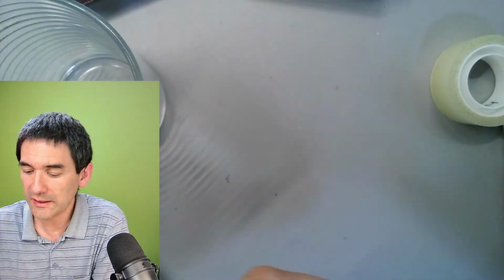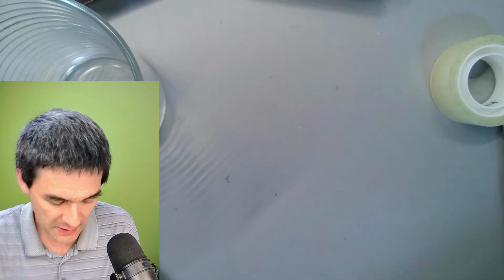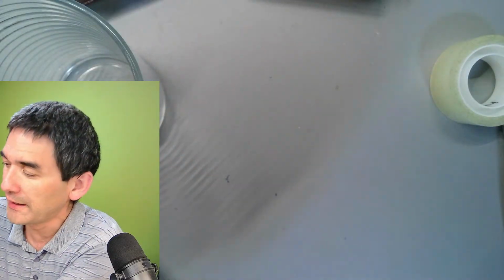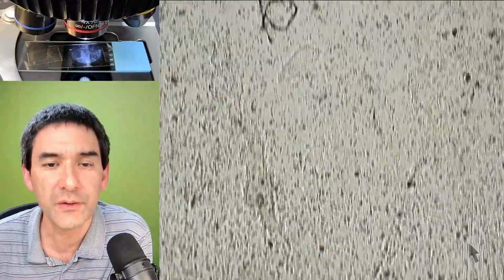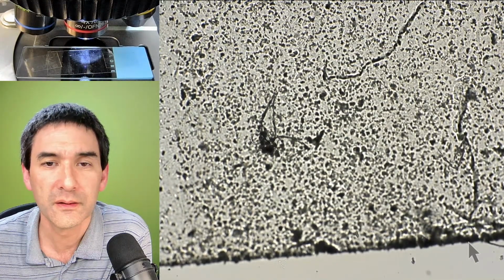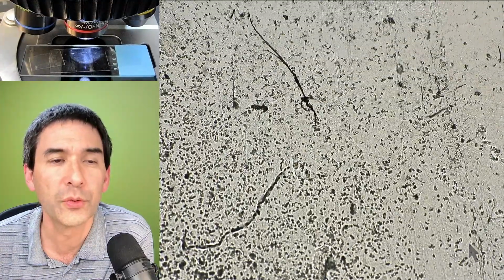Yeah. So let's do the following. This was the one where I was not able to find one. I'm going to put this away, and over here, I've got another one, and let's try to find it here, and then let's also add some oil. Okay. You see that's very dense with many cells. But I think I almost forgot.